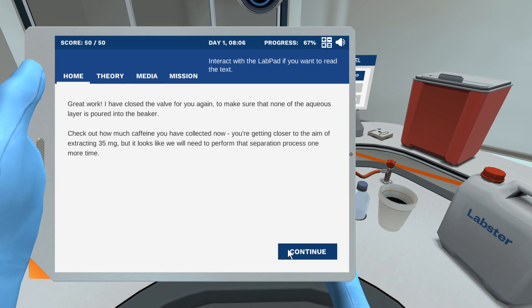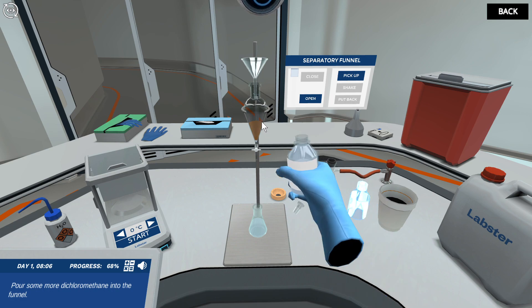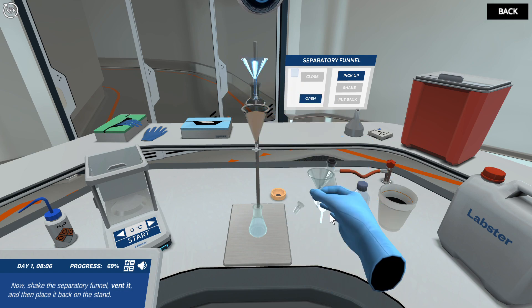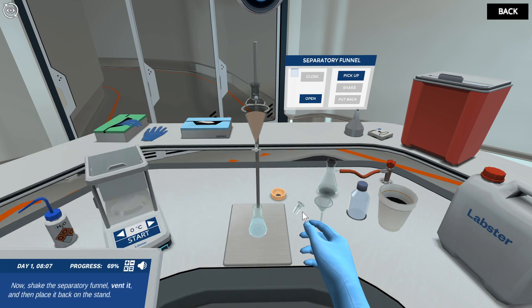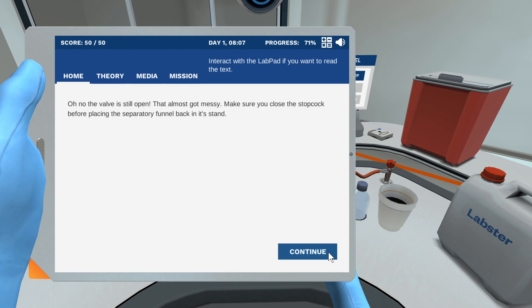I have closed the valve for you again to make sure none spills. Pour some more dichloromethane into the funnel. Shake the separatory funnel, vent it, and then place it back on the stand. Remember to vent! Collect most of the organic phase into the empty conical flask. Oh no, the valve is still open — that almost got messy! Make sure you close the stopcock!